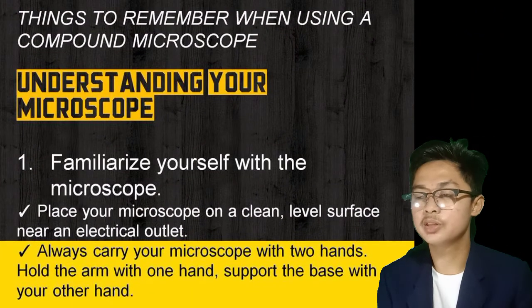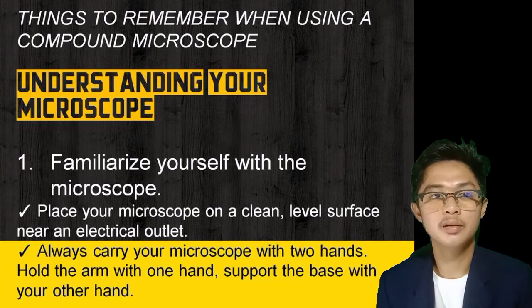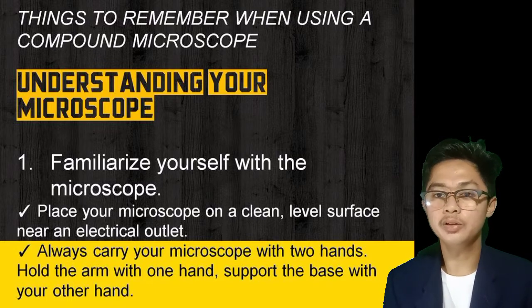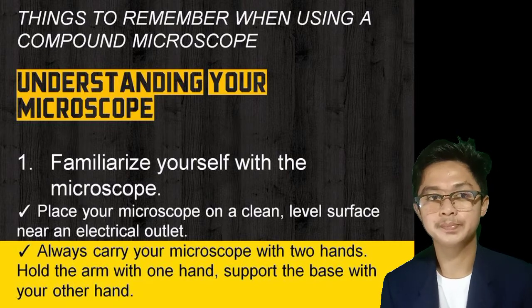Things to remember when using a compound microscope. Understanding your microscope. First, familiarize yourself with the microscope. Examine all the parts and learn their function and their names. Check if the parts are complete.